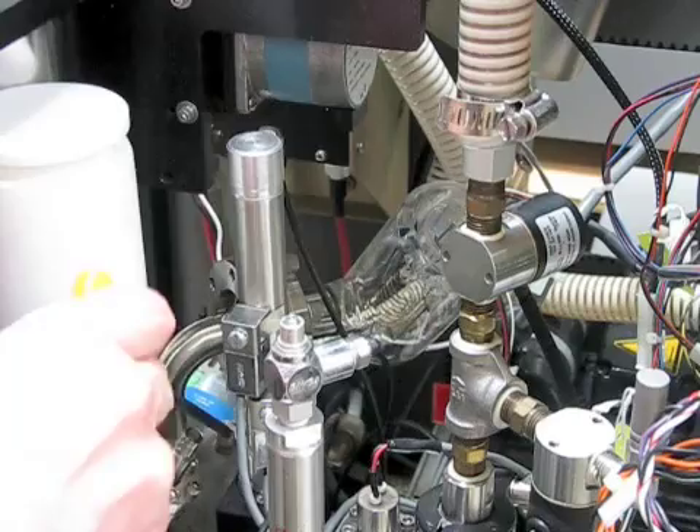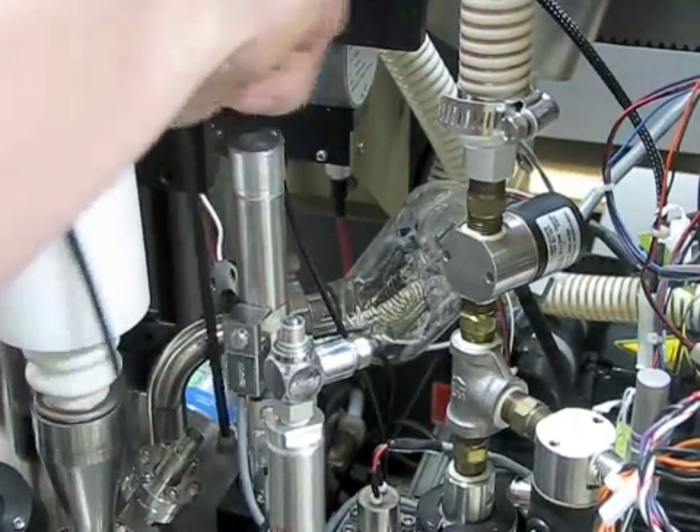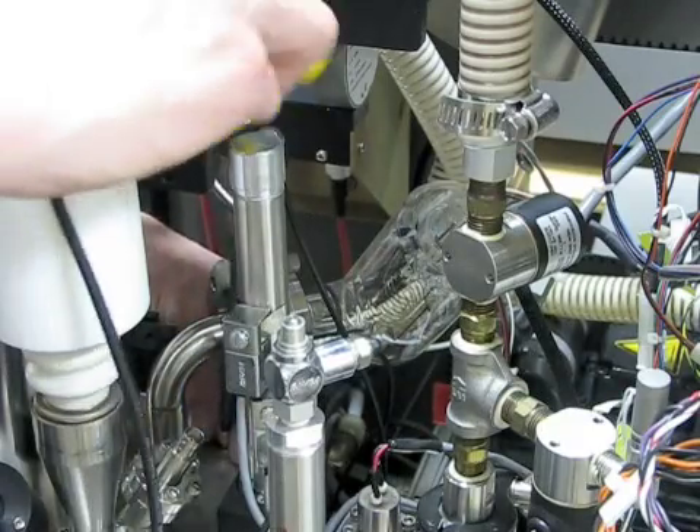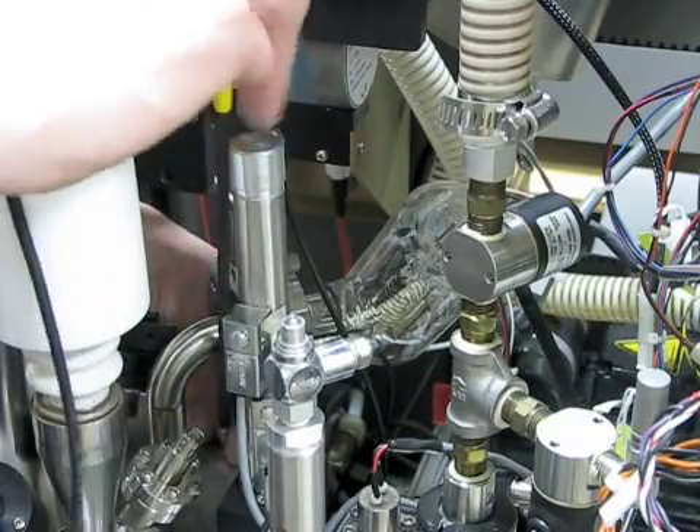This is the most difficult screw to remove. You will need the 3/16ths T-handled Allen wrench to make this job easy. Reach around with your other hand to remove the screw so that you do not drop it.